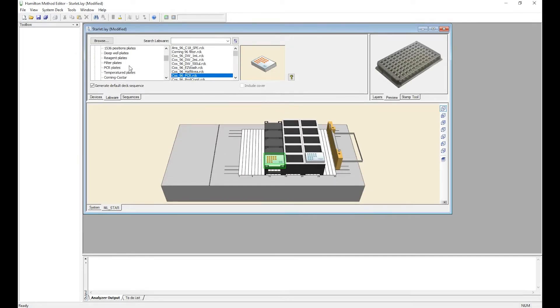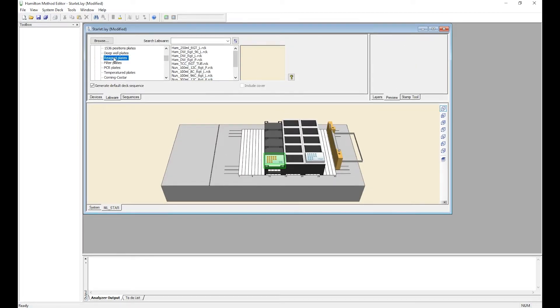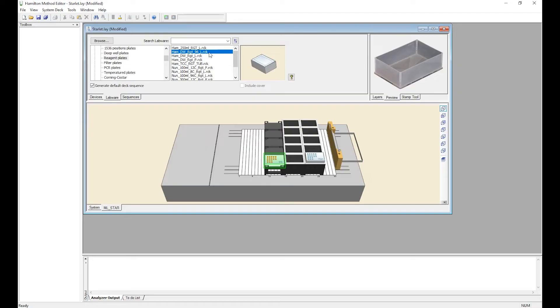Now we're going to add our reagent plates to the deck. Hamilton Deepwell 96. We're going to add our reagent plate to the deck.